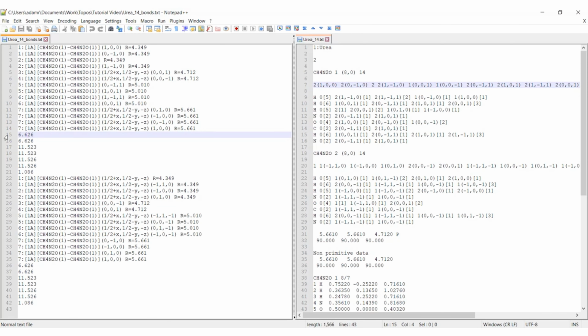These are the first approximation generated by ToposPro, but they don't really correlate with the free energy of crystallization because there's no consideration of desolvation. So even though topologically they should be stronger bonds, there may be a higher penalty for desolvation in certain solvents versus the energy regained when adding to the crystal. So it doesn't necessarily mean that a stronger bond would mean a stronger free energy of crystallization, because it cuts both ways. It may be a stronger interaction with the crystal, but it's also going to have a stronger interaction with the solvent. So these are likely going to require adjustment.